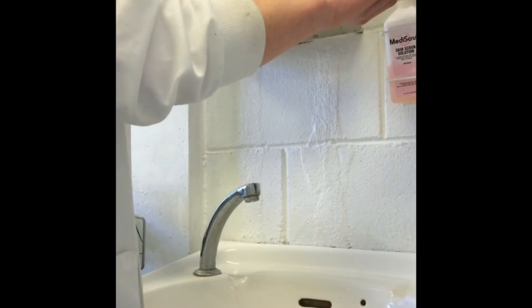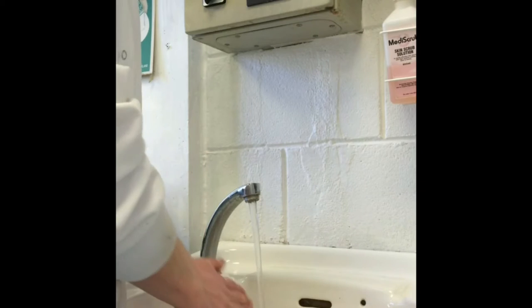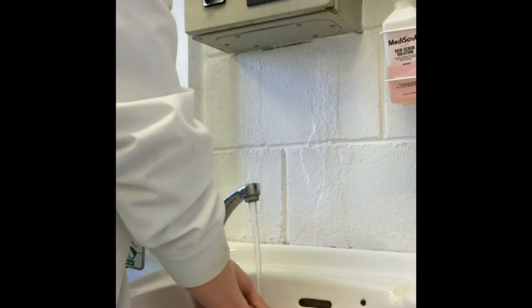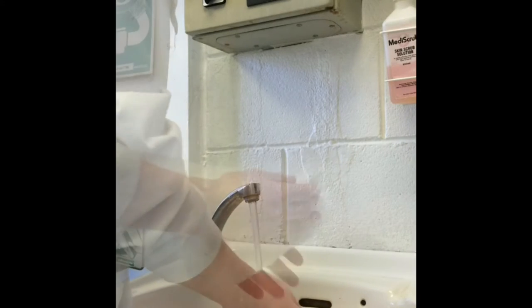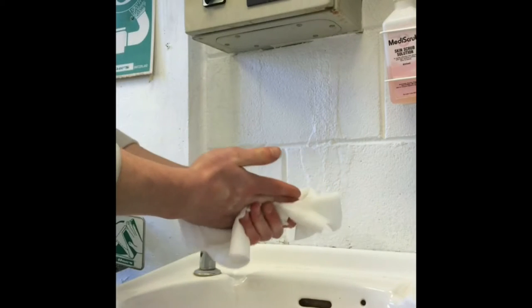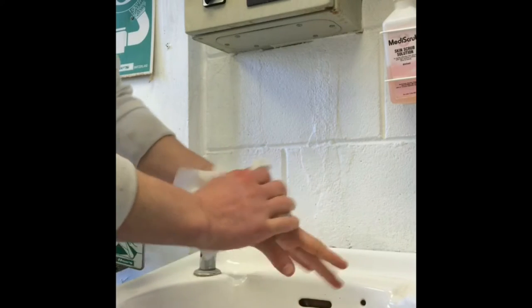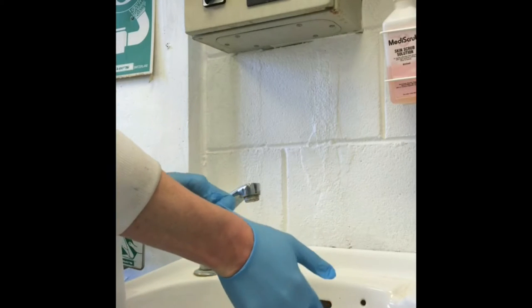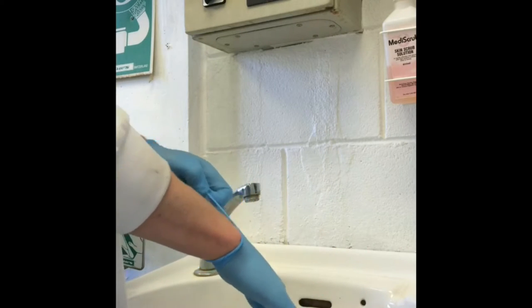You must wash your hands following proper hand washing technique. Make sure to wear gloves for protection.